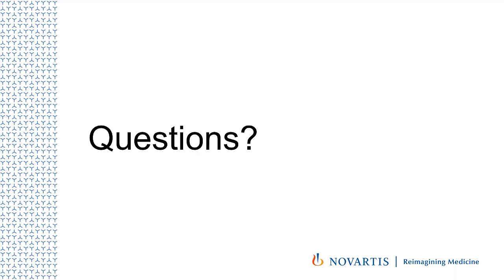Hard to answer that question. I don't know. We have one system, and that's the only thing we actually tested. We have several setting options in the tool, meaning that you can select a certain range of charges as well as a certain range of Dalton that you want to look at. But I don't really know what would happen if you use another sort of system. I think the developers of Mestre Labs should just try it and see if this works.